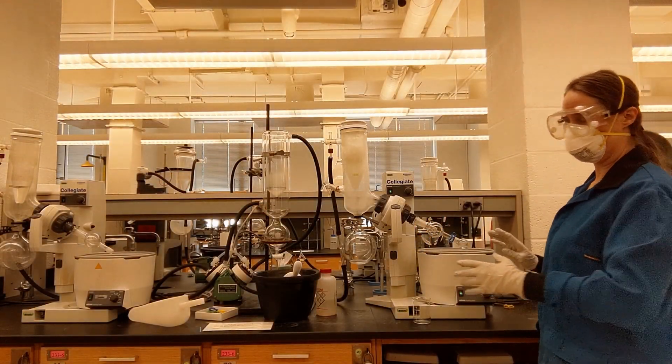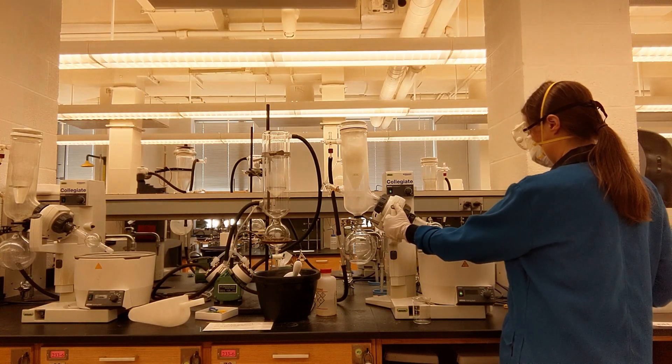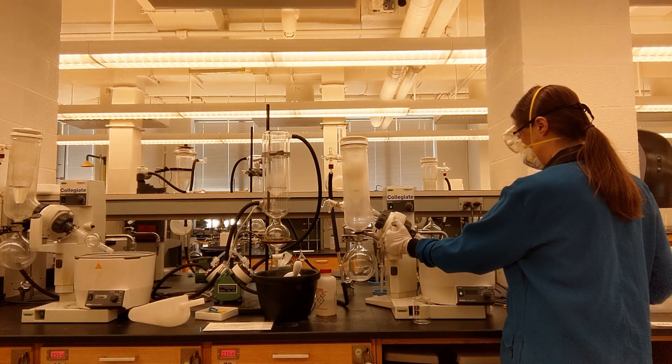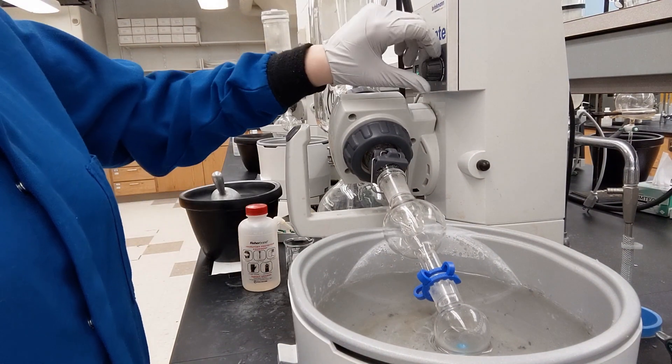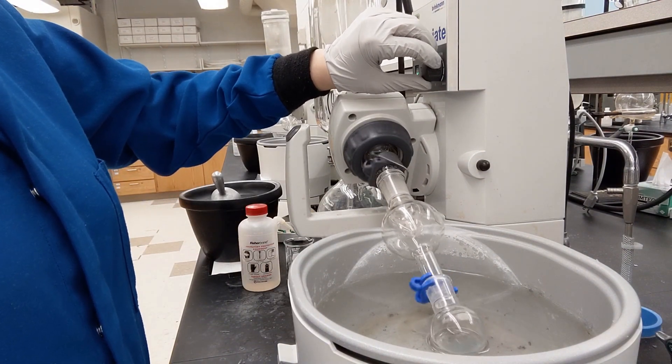There are four more things you need to do to actually get this started. One is lower the sample into the liquid such that the top levels of the liquids are somewhat equal to each other. Two, start the rotation.